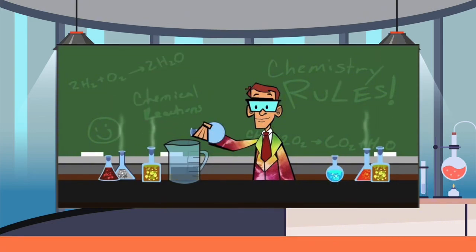Notice the scientist's gear. While he wears glasses, he lacks a proper lab coat, gloves, or a face shield. When the explosion occurs, his skin and hair are directly exposed to the blast. This highlights the importance of personal protective equipment (PPE) as the last line of defense against thermal and chemical burns.